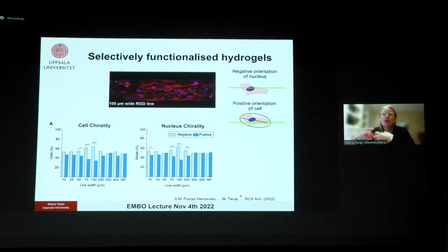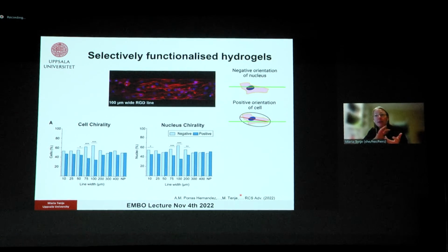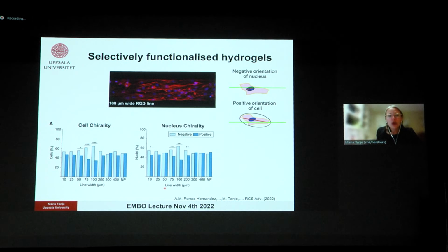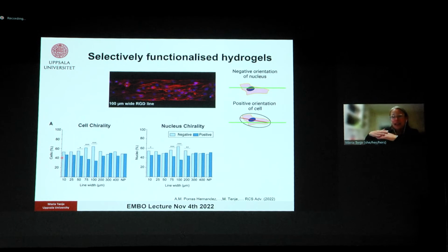And that's an aspect that's very important in developmental biology, because we are not symmetrical as we develop. The cells need to get cues that break the symmetry so that the organs can develop properly. And we could see that these brain endothelial cells also had a preference in their orientation. You can see that if you have a non-patterned surface, there isn't a preference. And it's mostly pronounced in the 100 micrometer wide lines, and it gets less and less pronounced as the lines either get thinner or wider.